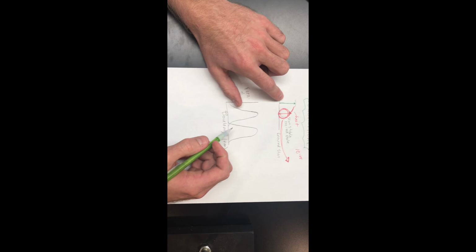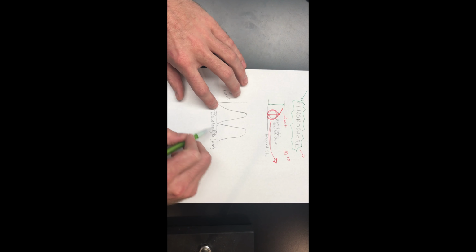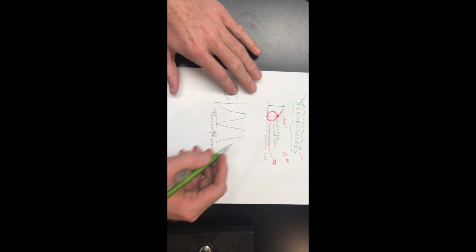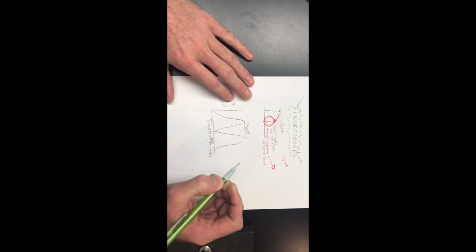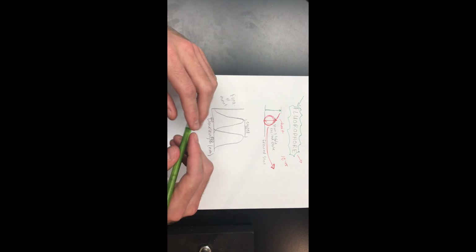As I stated before, that energy that is lost is accounting for that change in wavelength. That's what's known as a Stokes shift. A Stokes shift is just the difference between the excitation and emission maxima values.